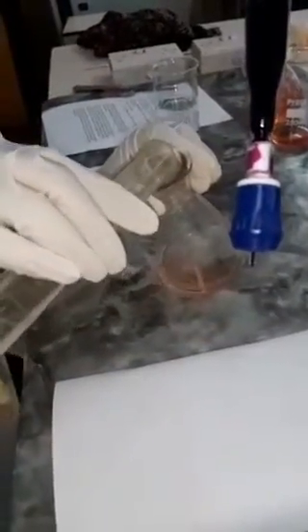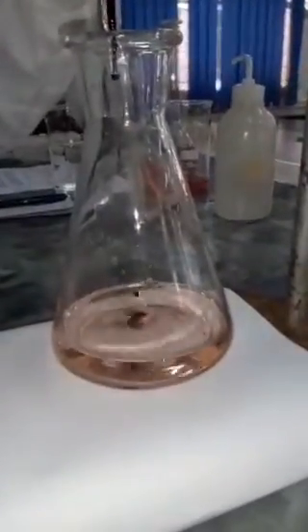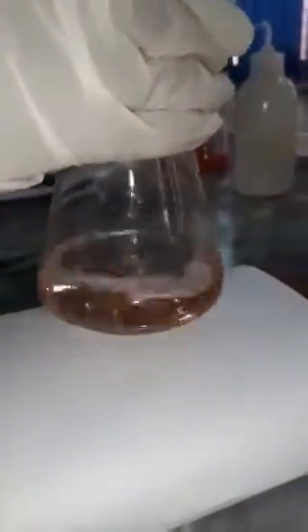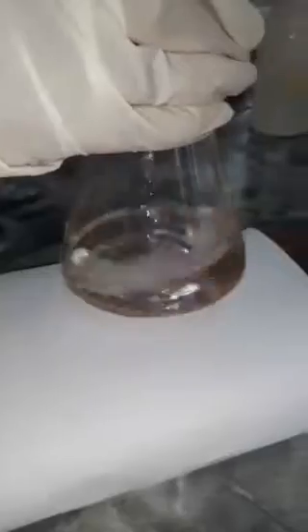And like the first one, I'll add 25 mL of the acid. I've already pipetted 25 mL of the iron sulfate solution. Now I've added the acid, and then I'll proceed with the titration. My initial reading is 5.7, and then I'll titrate until the color change. So when we are close to the end point, we add drop by drop until the color changes.